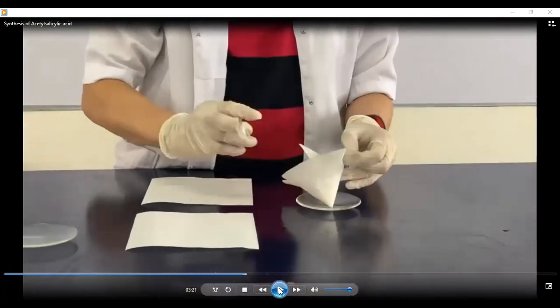So what I did here is, after washing it with cold water, the next step is to dry the powder. I used filter papers to somewhat dry the powder a little. Or it's not really a powder anymore, it's granules. It is wet, since it was added with water.